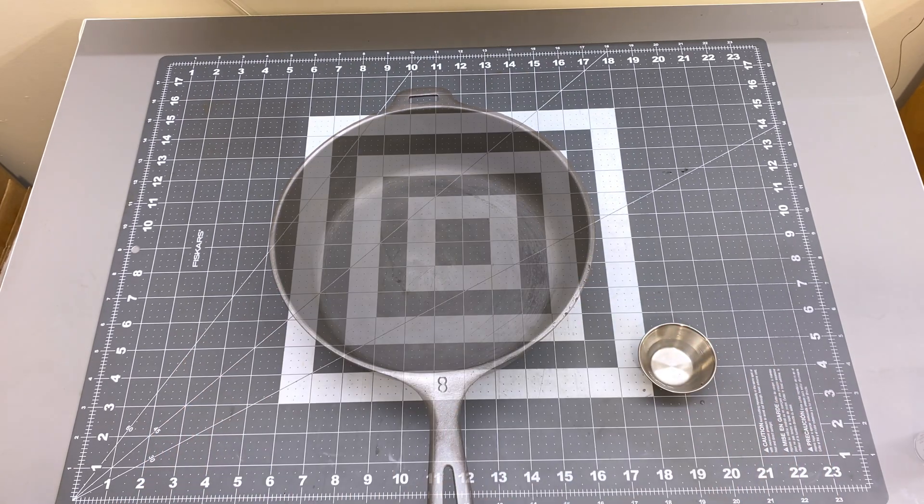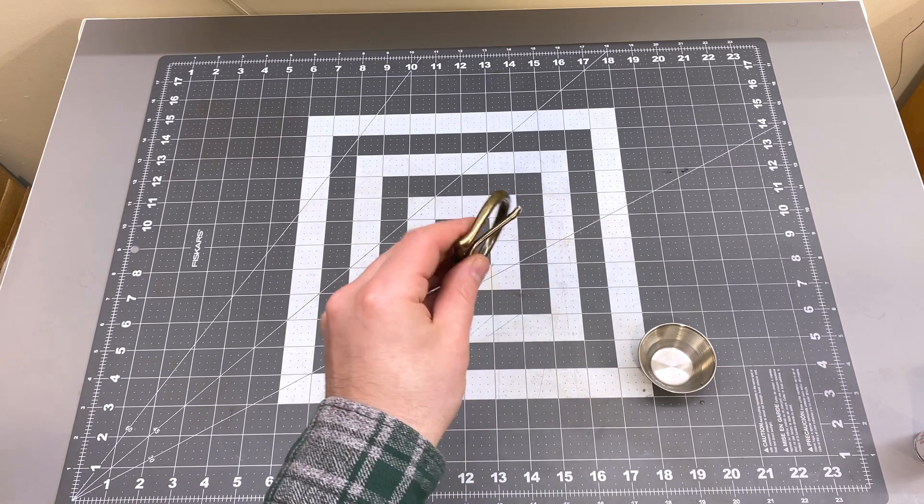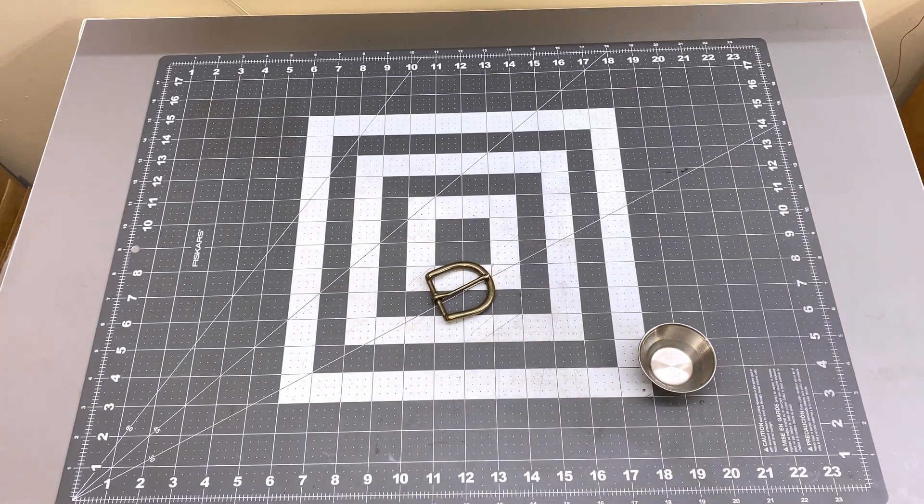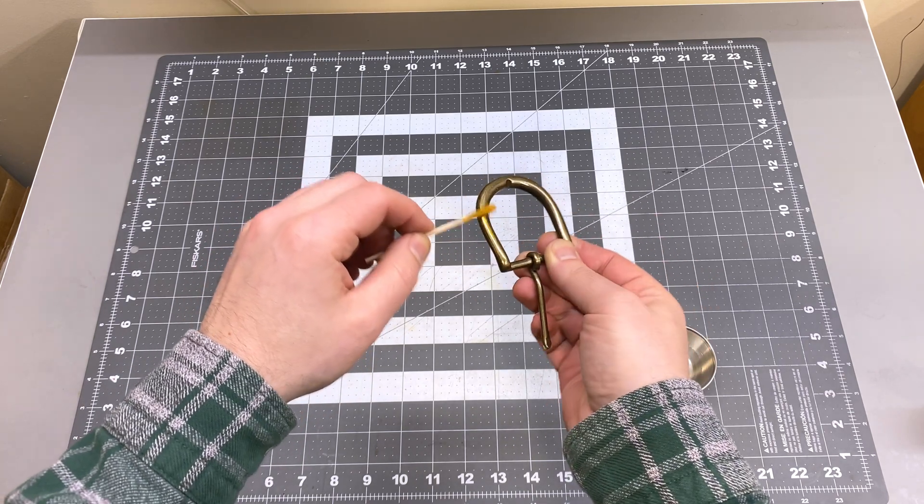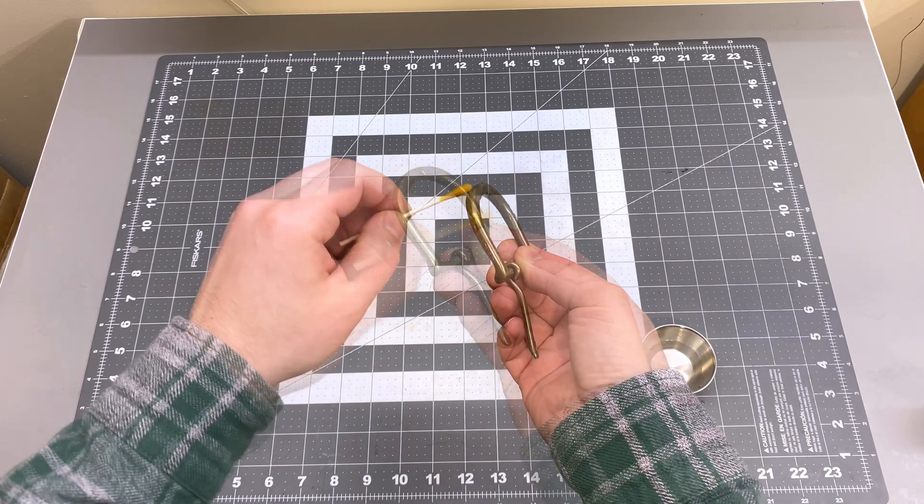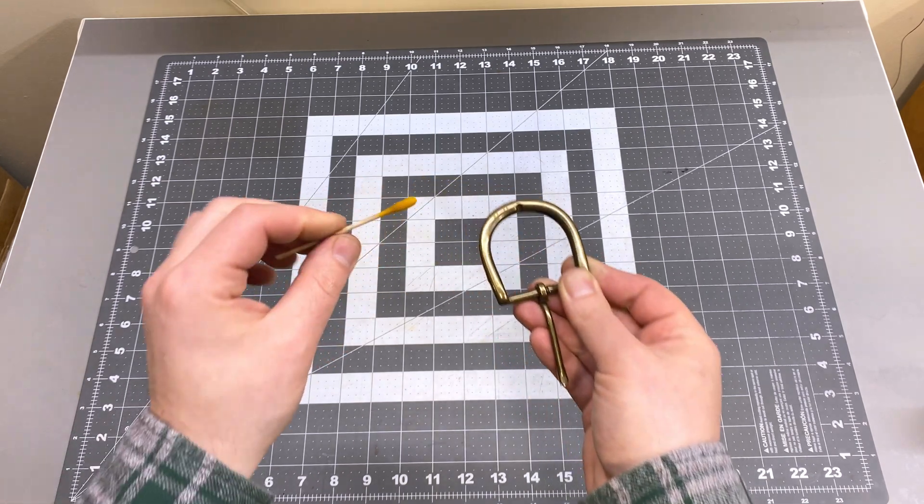So while this is encouraging so far, I do want to test these swabs to see if they actually pick anything up. So I've got some low lead brass here, which should be under 100 parts per million, and I want to see if this swab will pick anything up.